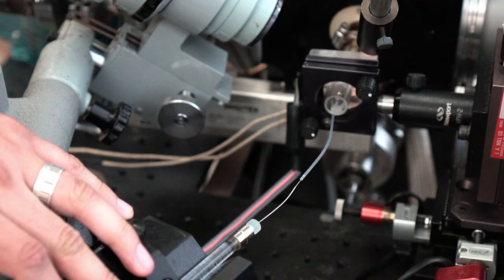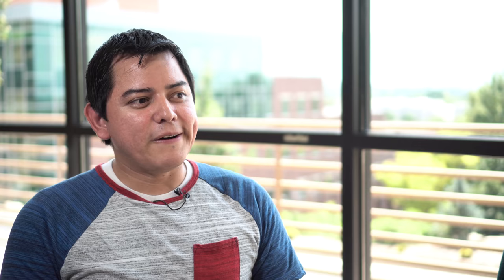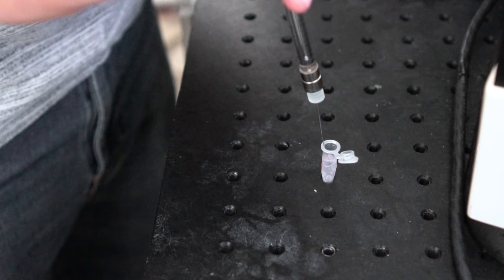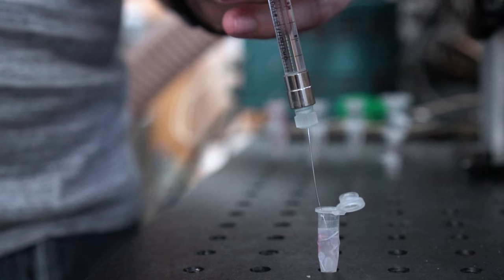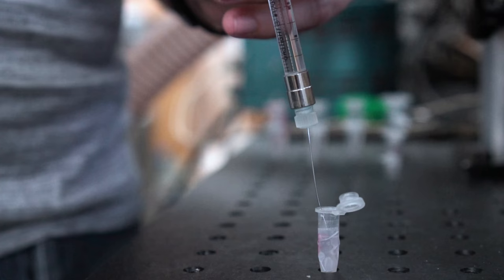Dr. Durden's lab focuses on mass spectrometry. We're trying to create internal standards to measure different cross-sectional areas so that in the future people can measure the same molecules using one of my samples to reference back to a known sample and use that to correlate the different cross-sectional areas without having to measure themselves.